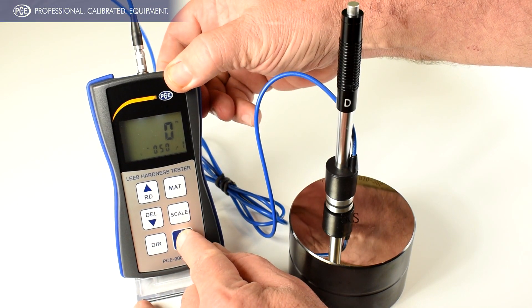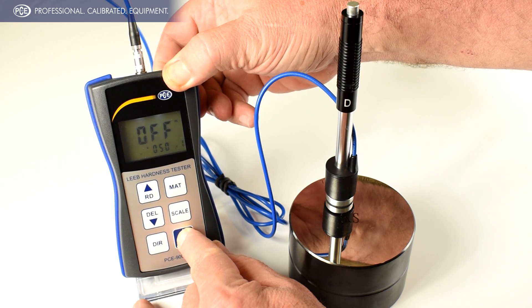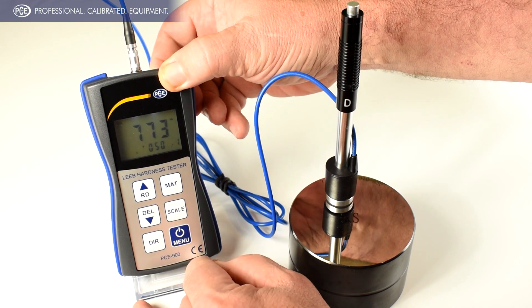First we're going to put it in CAL by holding the on-off button. Eventually it'll show the CAL mode. Release.